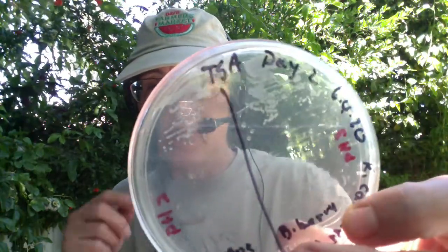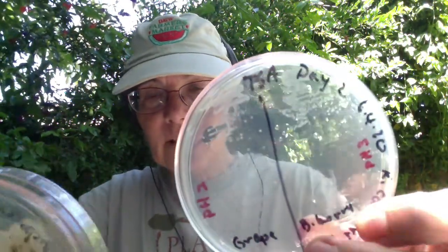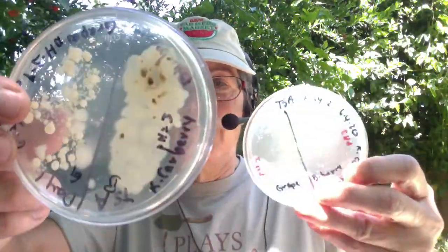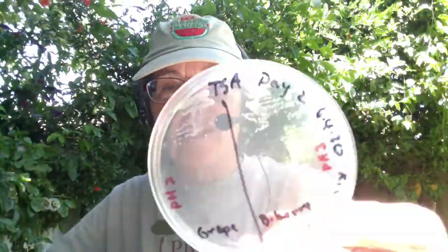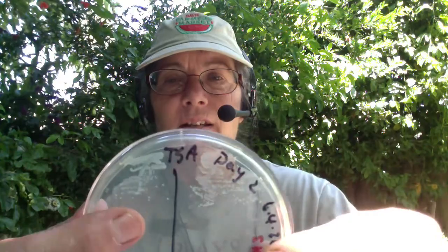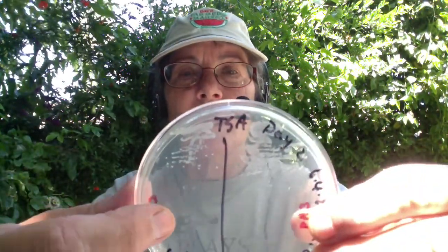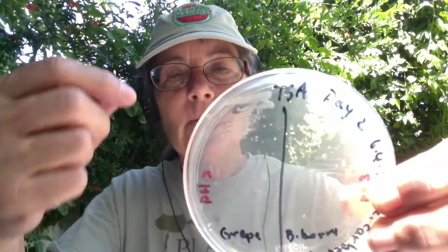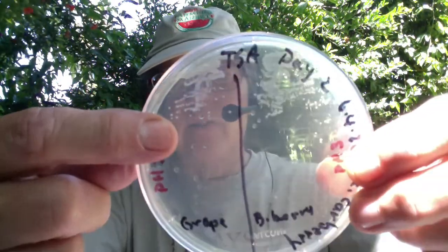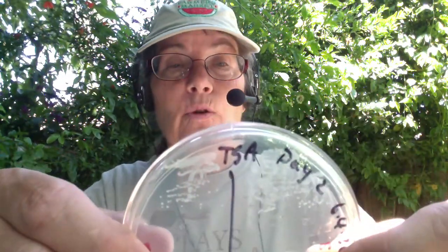And again, gosh, you guys, sorry, the contrast here isn't very good. So on this side, this is our grapes, and what I think I'm seeing in comparing the grapes from day 1, wow, I think we're getting selection for some kind of microbe here. Oops, sorry, that's the blueberry side. So on the grapes, you can see we're not getting the variety of colonies that we had before. I'll continue to let this plate incubate in our garage, and of course these colonies will get bigger, but it looks to me like maybe one or two of the microbes are winning out, right? We've got kind of a microbial competition going on in there, and maybe the conditions of it being anaerobic are selecting, who knows, maybe for Saccharomyces, we're hoping.